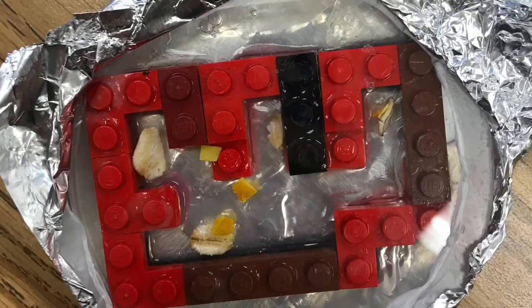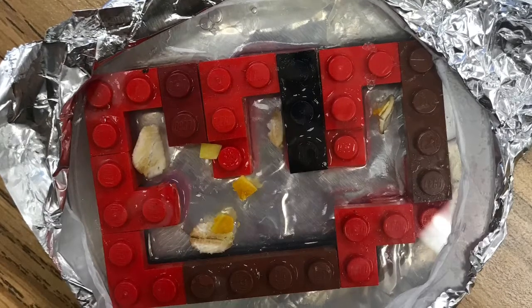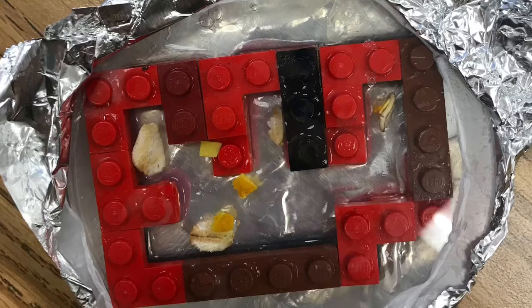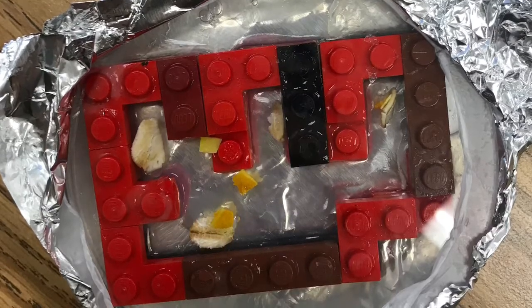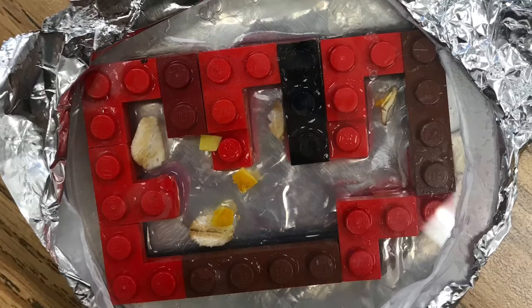To start this lab, my group added 4 sterile oats to a petri dish filled with agar. We then introduced 4 cultures of slime mold and placed them on the oats, which was their food source in the experiment.